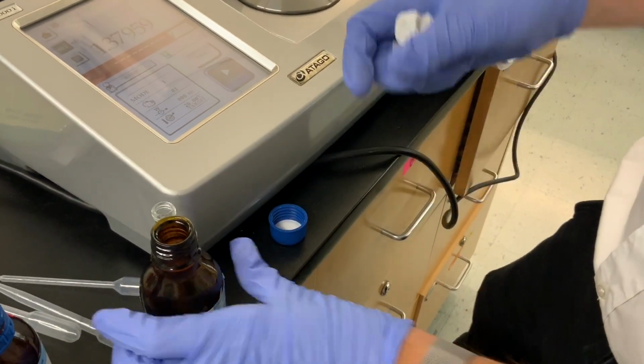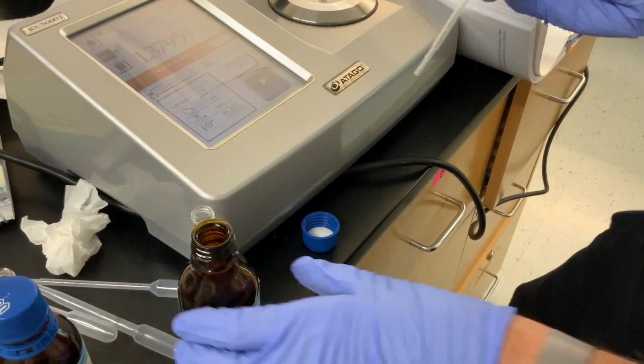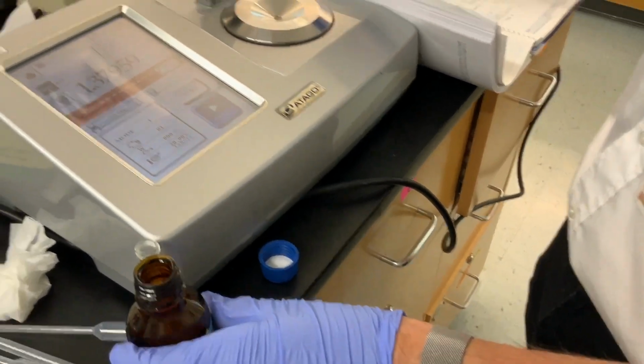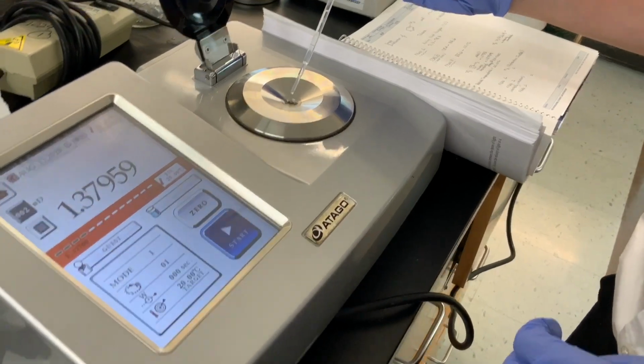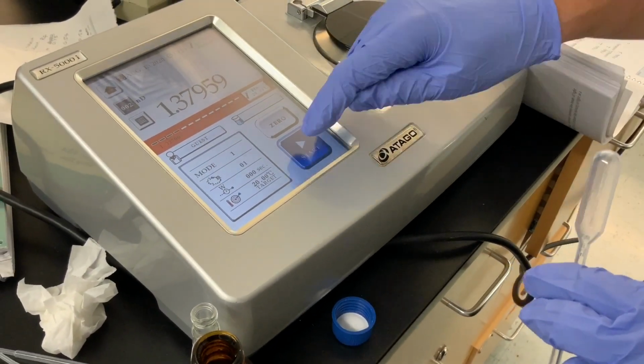And I'm going to use a new plastic graduated pipette, toluene, pure, standard, a couple drops there. Press start.